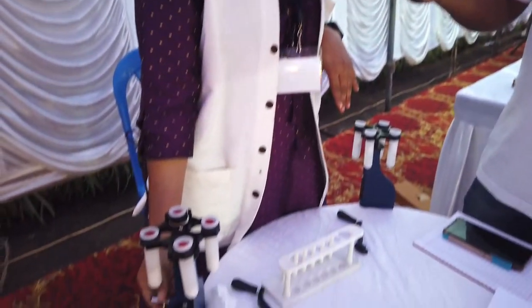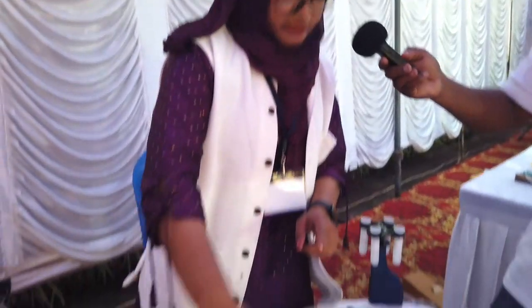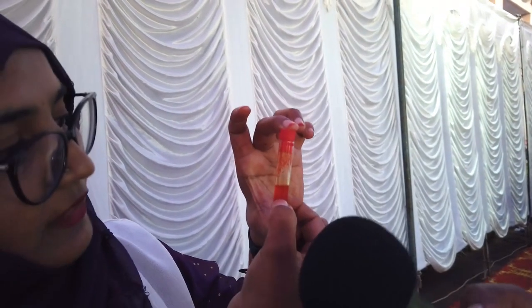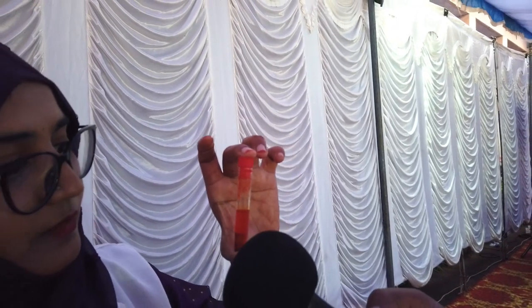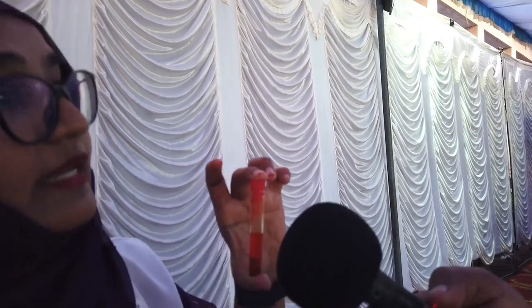While rotating, we are applying centrifugal force, and the separation happens due to that centrifugal force. You can see the test tubes rotating — there's gravity acting as well. The particles which are higher in weight deposit at the bottom, and that is called the pellet. The lighter particles which are separated on top are called the supernatant. There will be many layers if you use many different mixtures.